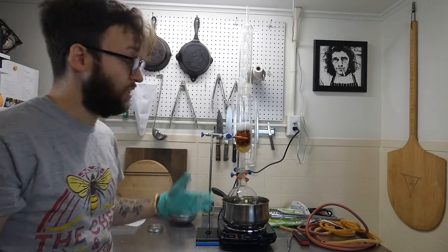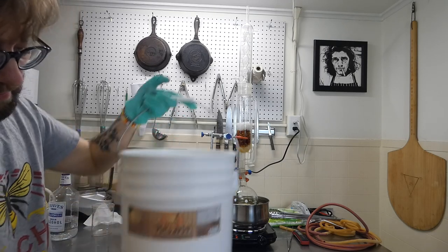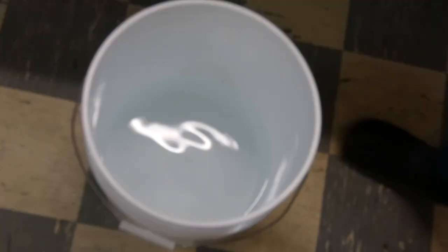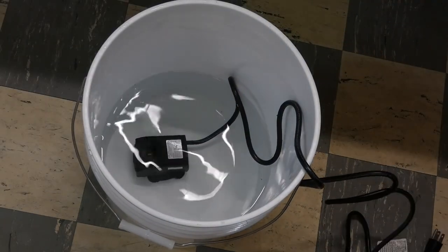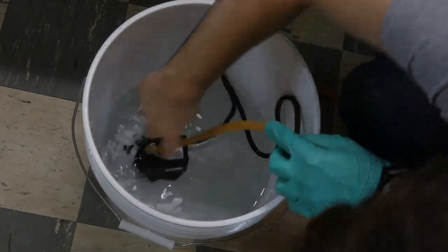So now the other thing to do is hook up the water source. So you take your 5-gallon bucket, half full of water here. You're gonna put your aquarium pump in. Then you're gonna hook up one of the tubes to this part here. So you just screw it in like so. Make sure it's hooked well.